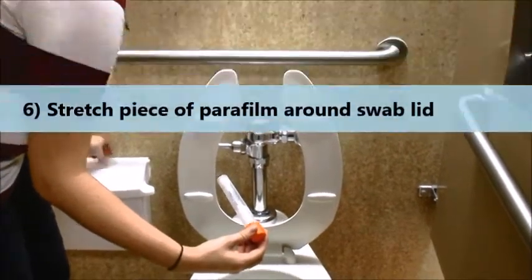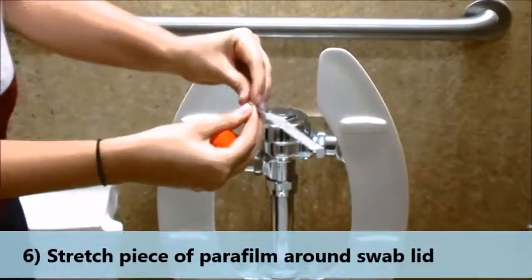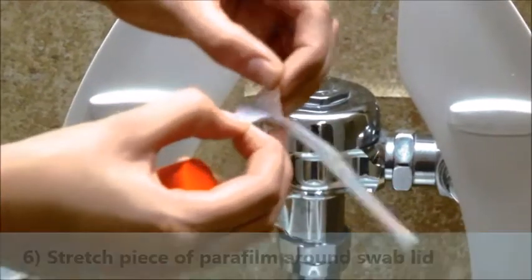Take a piece of parafilm and separate the plastic from the paper. This is best done by folding the corner. Stretch the plastic part of the parafilm around the swab lid to create a seal.